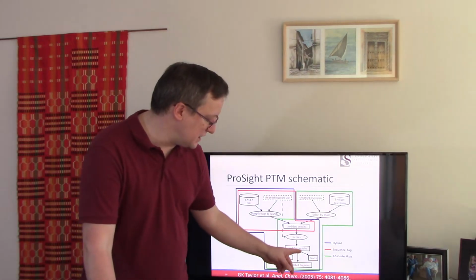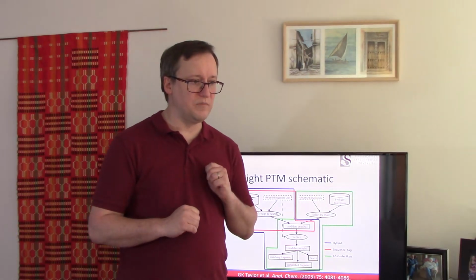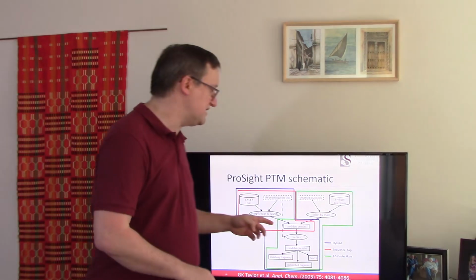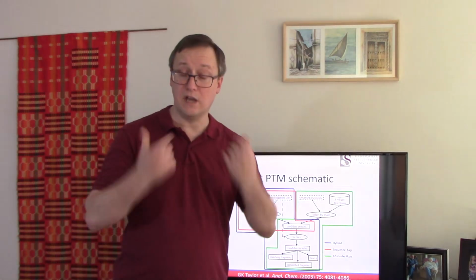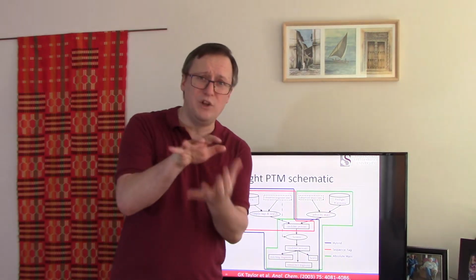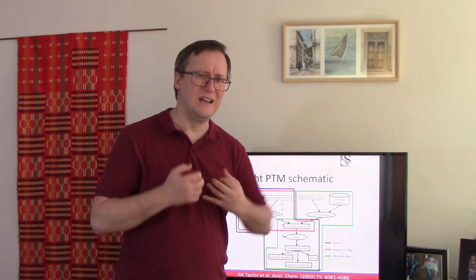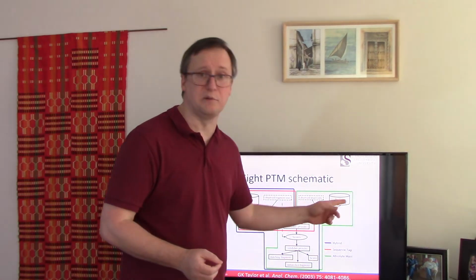Now, consider the possibility that you are able to narrow down a very small number of protein sequences based on the intact mass of the proteoform and on the basis of the fragment ions you've observed, you got this tag. So we have a relatively small number of proteins now to compare to a tandem mass spectrum. But how do we handle the fact that there may yet be some ambiguity about which particular proteoform?